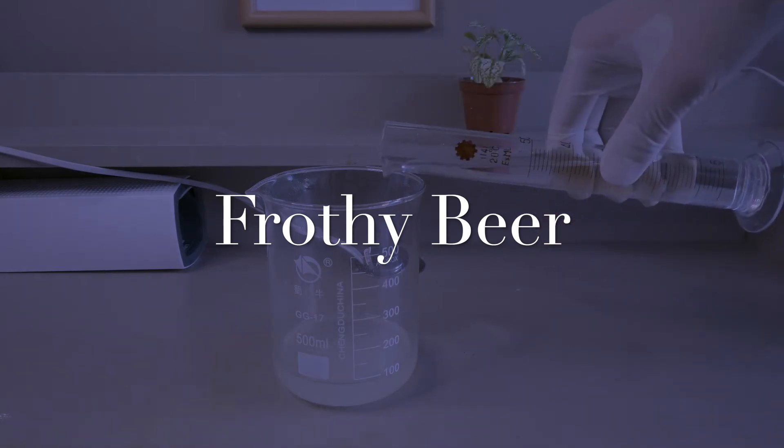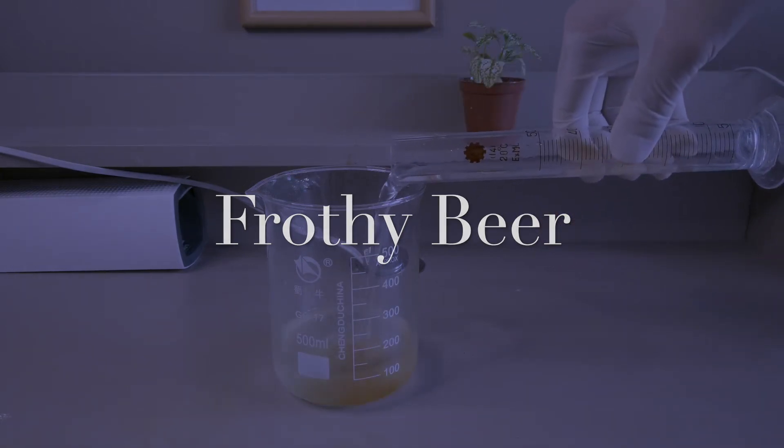Our next reaction is called frothy beer. It was accidentally discovered when we were trying to make iodine crystal a long time ago.